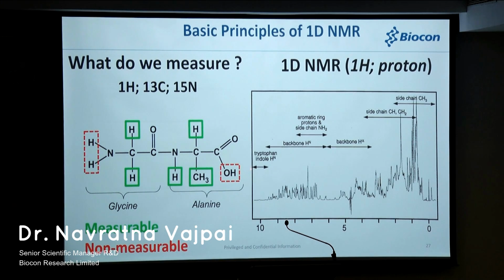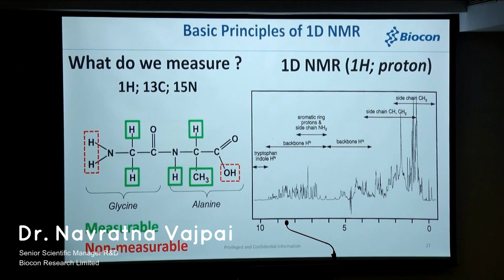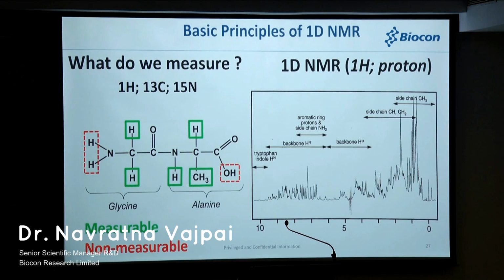Now, the best part about NMR is that over the years people learned the pattern of these chemical shifts and also the regions where individual atoms fall if I have a regular structure. So for example, amide protons will always come in this region. Side chain or actually methyls would always come in this region. And that is why when Ashutosh was explaining that you can design your experiment essentially to pick regions of your product. And that's what is shown here.